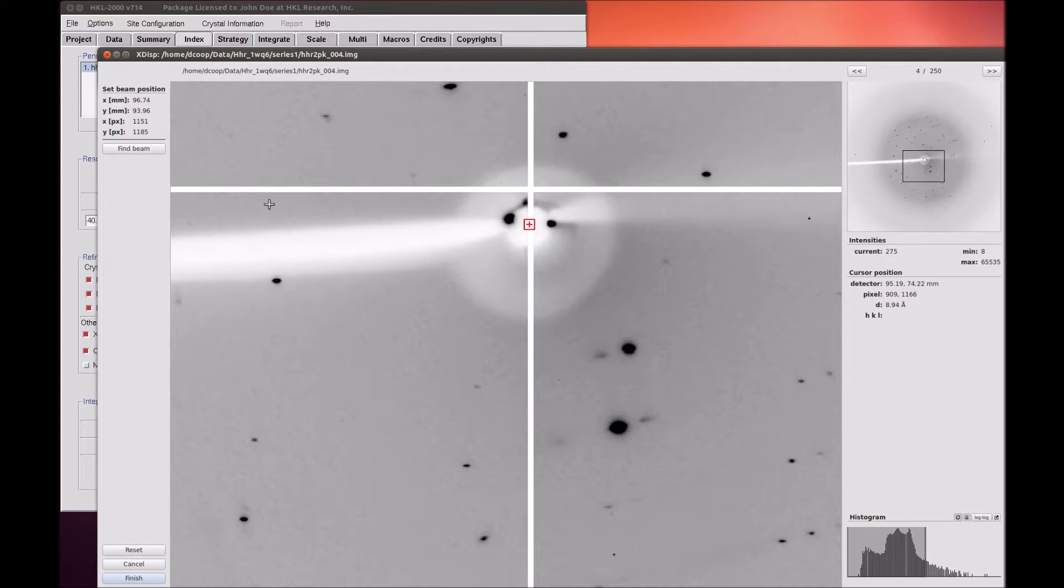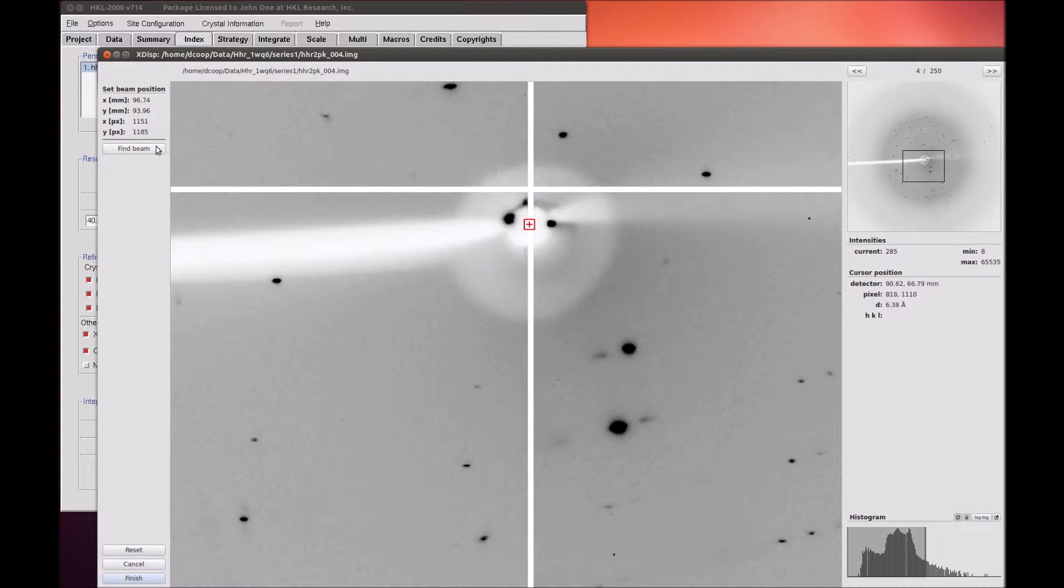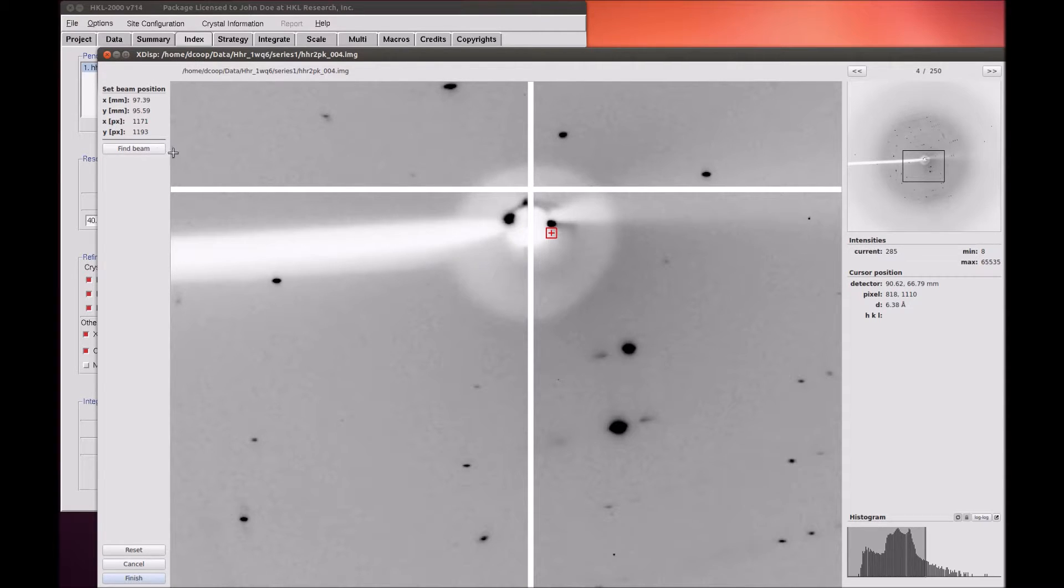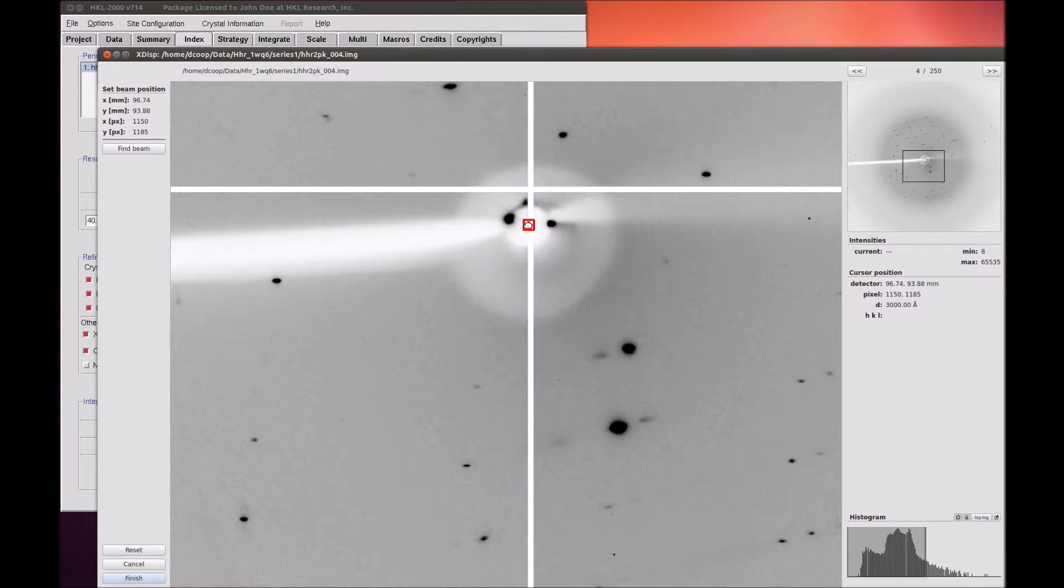XDISP QT also has a built-in function to find the beam center that can sometimes determine the beam position automatically. This algorithm relies on the distribution of background scatter or ice rings and doesn't always work.